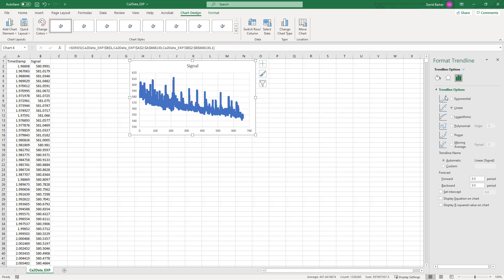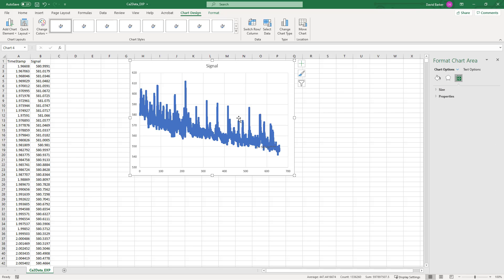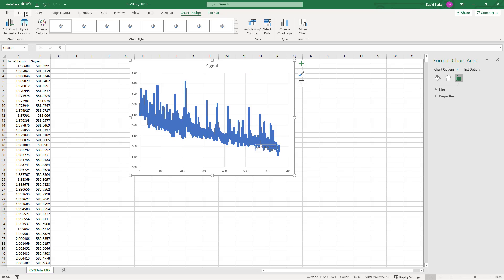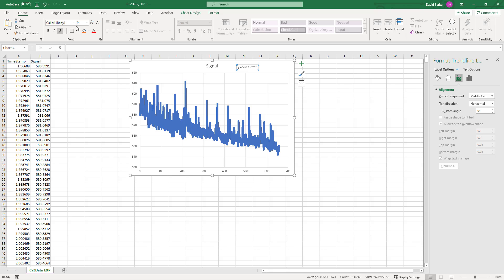What we're going to do is we're actually going to add an exponential trend line. In truth you could add whatever you want, but my recommendation would be to use an exponential trend line. Then we'll display the equation for this on our chart so that we can see what the values are. This is usually placed somewhere obscure on the chart, so let's move it up to the top and then also make it a little bit bigger so that all of you can see this.